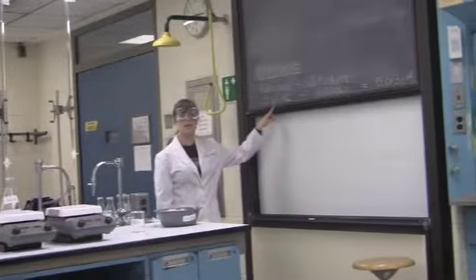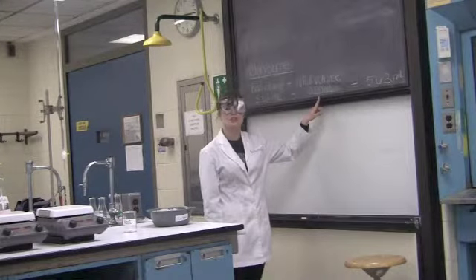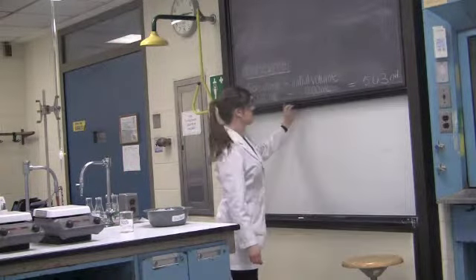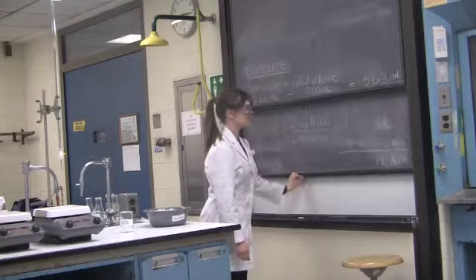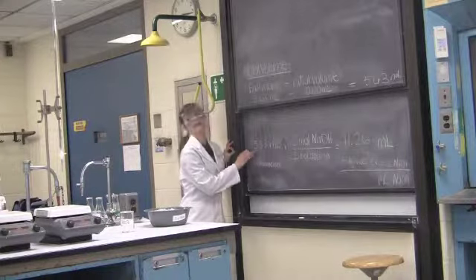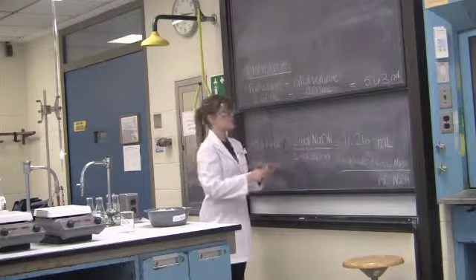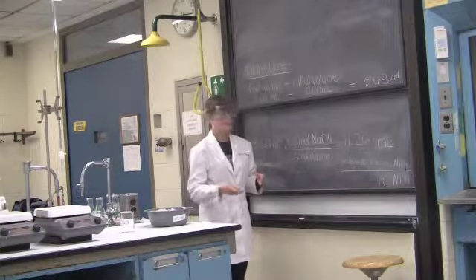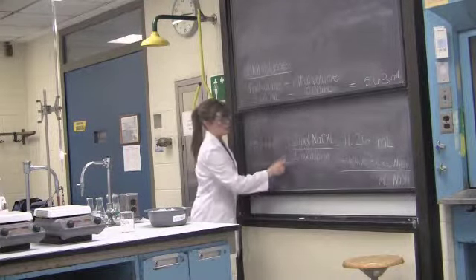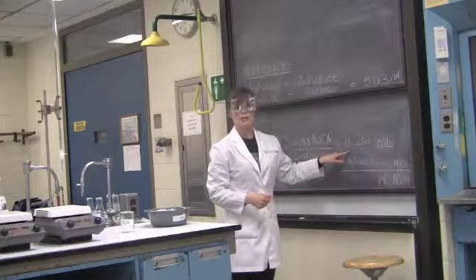Starting with our final volume of 5.63 ml, we're subtracting our initial volume of 0.00 ml to get a total volume of 5.63 ml. Now, we're going to take our total volume, 5.63 ml, and account for the ratio. In the reaction, we have aspirin reacting with 2 moles of NaOH. And so we have to account for this in our reaction by placing 2 moles of NaOH consumed for every 1 mole of aspirin. This gives us 11.26 ml as our volume.